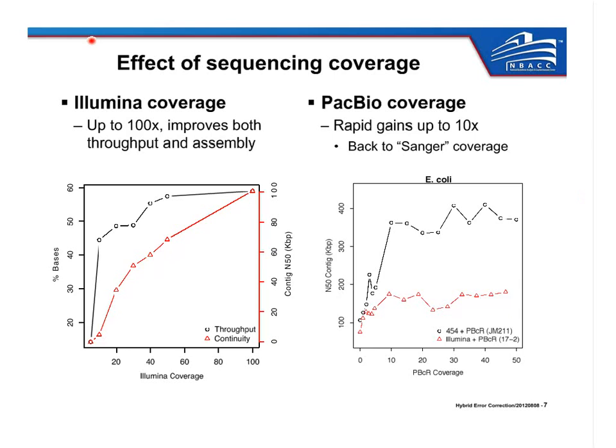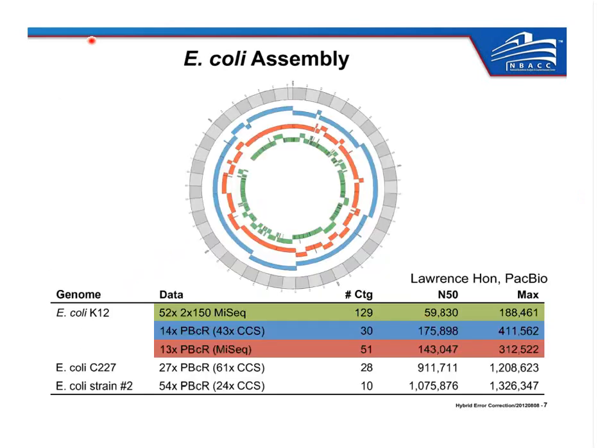Okay, thanks, Adam. Like Adam mentioned, I'm going to go through some of the results we have both from our paper and some more recent results. The first part, I'm going to focus on the bacterial results, and then I'll go on and talk about eukaryotic assemblies and what kind of improvements we can see in those using the PacBio long reads.